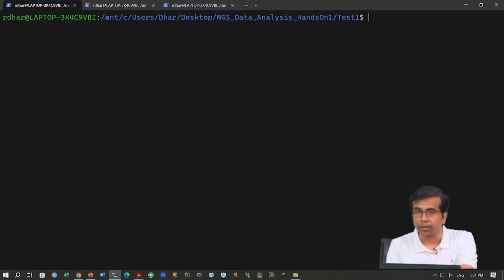Now, one of the things you will probably notice is that calling them through this dot slash is actually quite cumbersome. Every time you have to direct them to the folder where they have been extracted. If you go out of this directory and go somewhere else in this system, you have to point to the directory where SAMtools has been extracted and call the command samtools. Is there any way you can call samtools from anywhere in the system? It turns out there is.